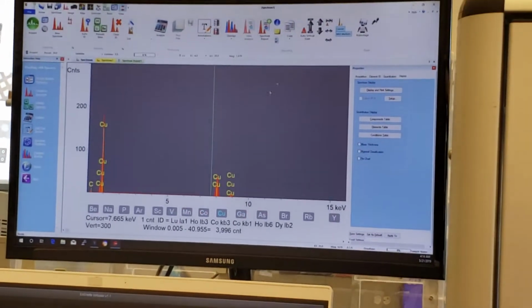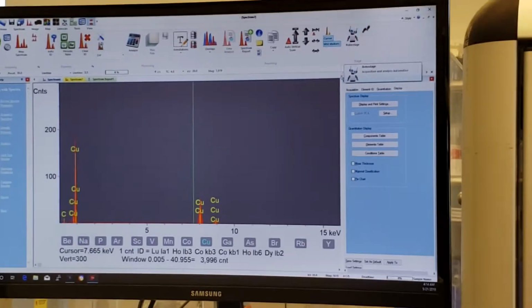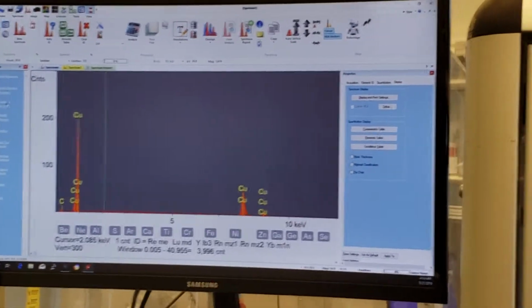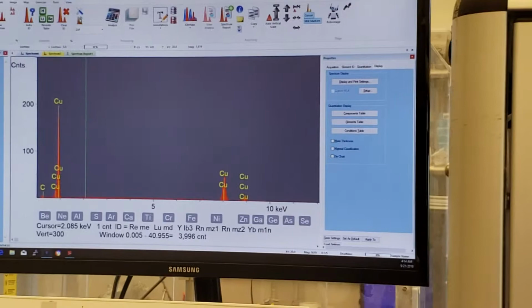And then you have this feature next to this, which is Robo Stage, and that'll be our communication eventually. Right now, that's not active. Okay? So realistically, that's everything in the EDS flow chart, as well as the EDS window. Let's go back here. Let's fire him back up again.